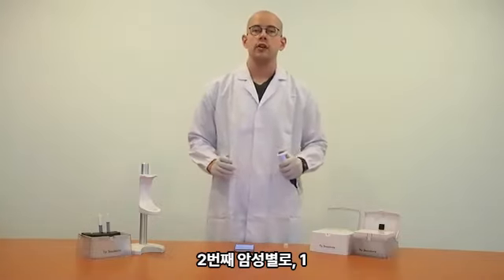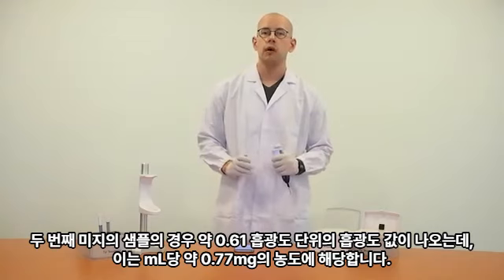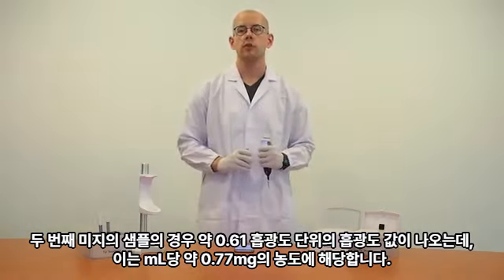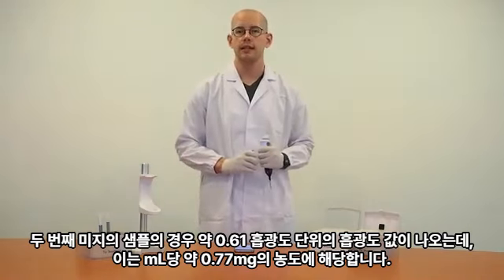For our second unknown sample, I see an absorbance value of about 0.61 absorbance units, which corresponds to a concentration of about 0.77 milligram per milliliter.